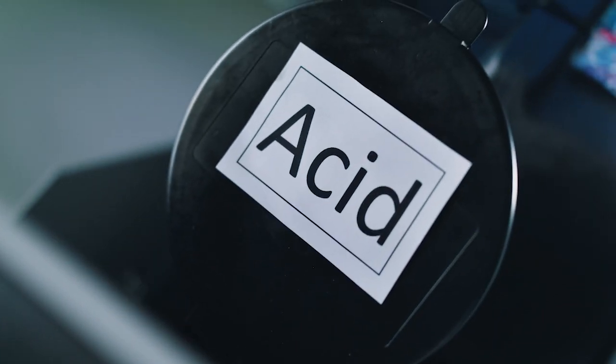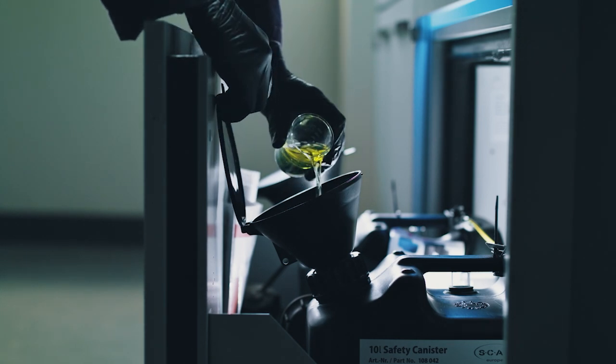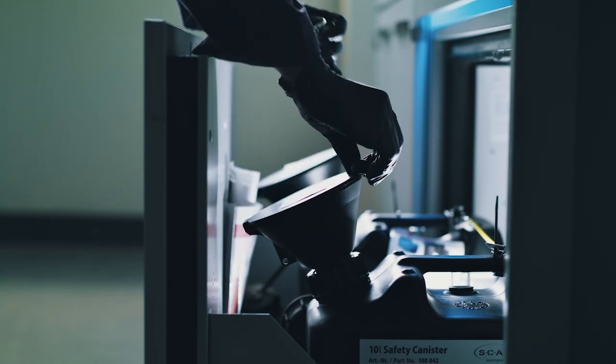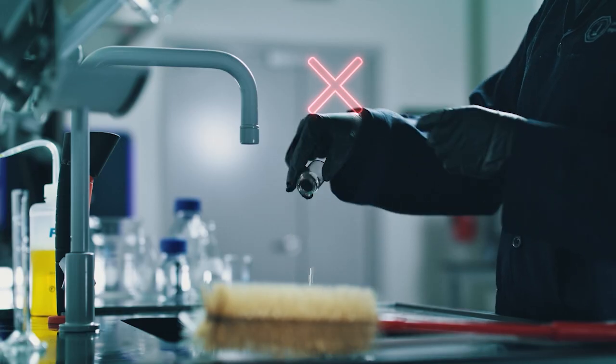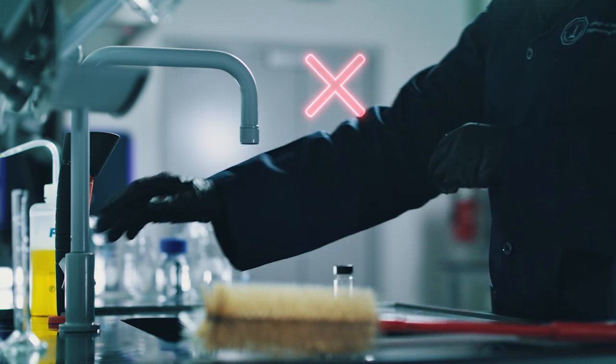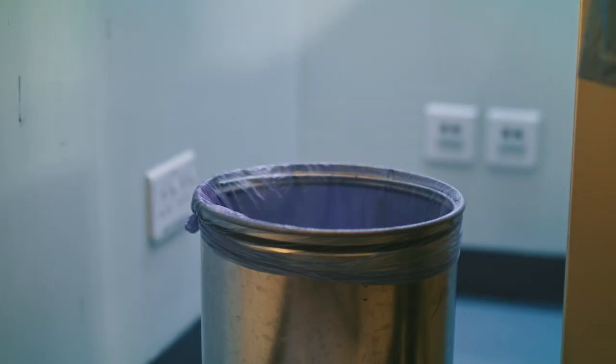Some general disposal guidelines are as follows. When disposing of chemicals, put each class of waste chemical into its specifically labeled disposal container. Carefully read the contents label and close the cap after use. Never put chemicals into a sink or down the drain unless your instructor conveys so. Put ordinary waste paper into a waste paper basket separate from chemical wastes.